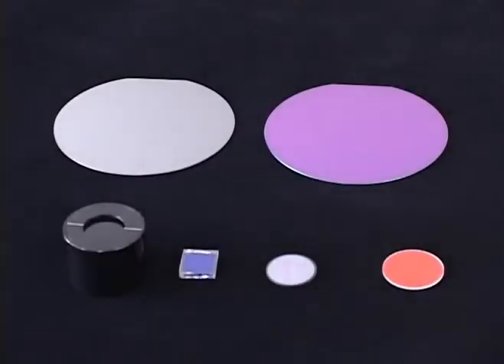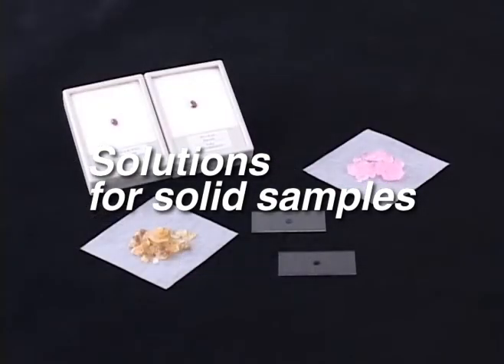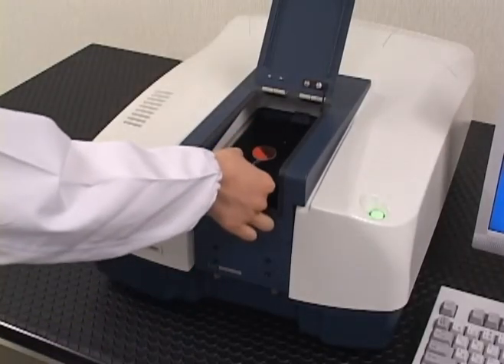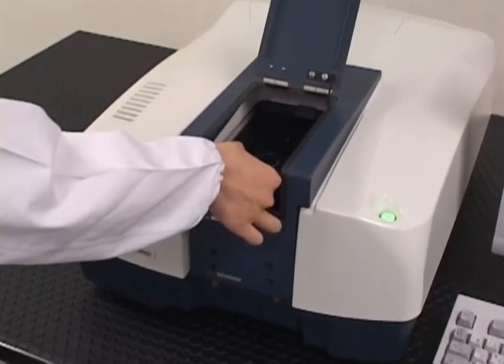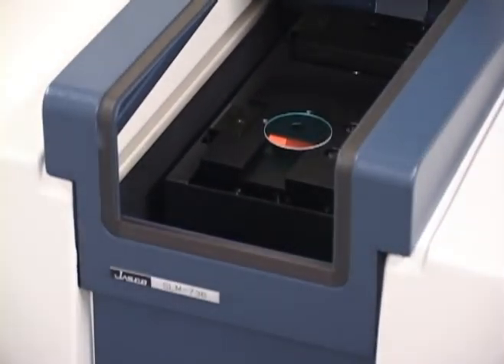JASCO offers several solid measurement accessories available for UV-VIS measurements, as well as the NIR region. Specular reflectance accessories, integrating spheres of different configurations, and absolute reflectance accessories are available for UV-VIS and UV-VIS NIR applications.